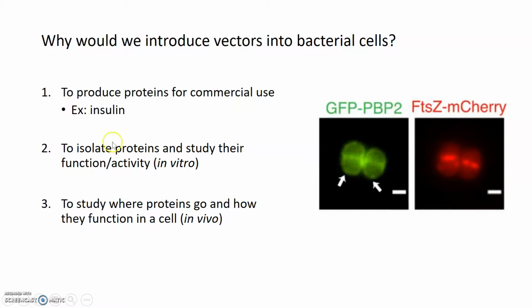We can also introduce different plasmids containing our genes of interest to study proteins' function and activities, more in like the research lab setting than the commercial one.